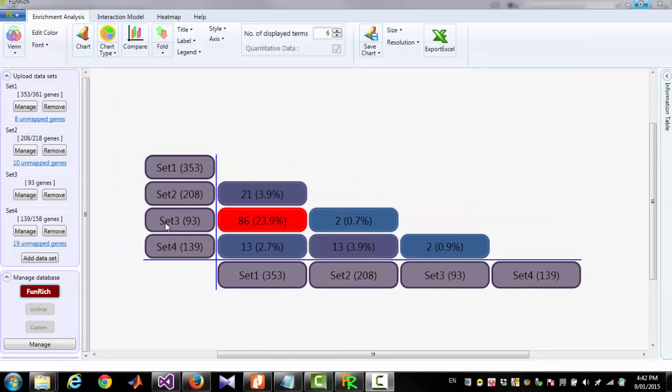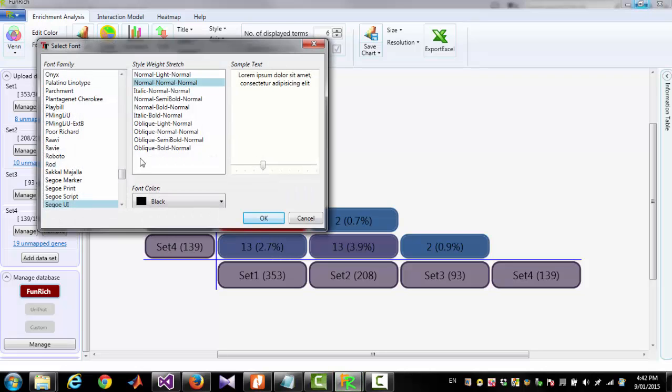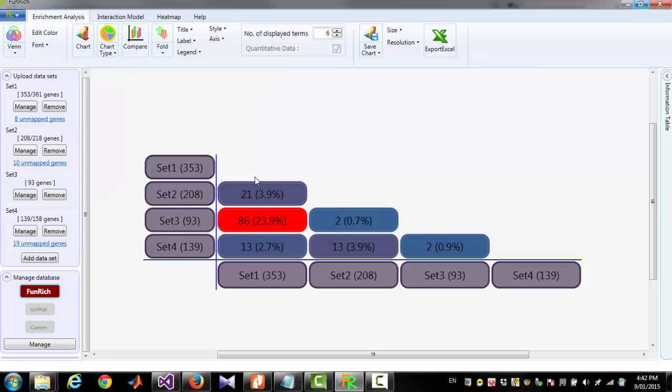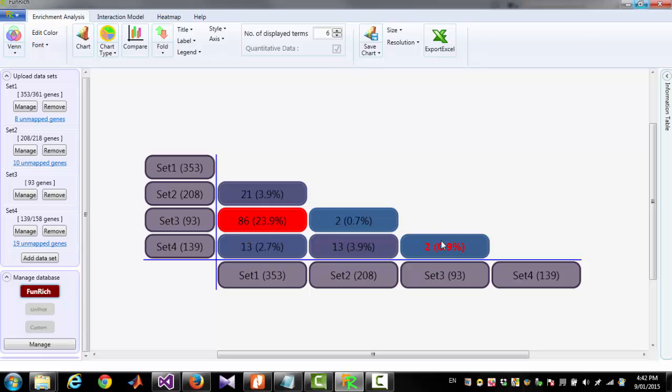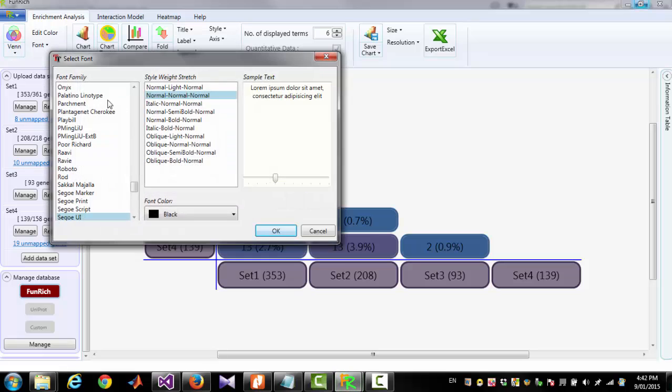You can change the font family and font size for the set names by clicking Label Font. And you can change the font family and font size for those numbers by clicking Number Font.